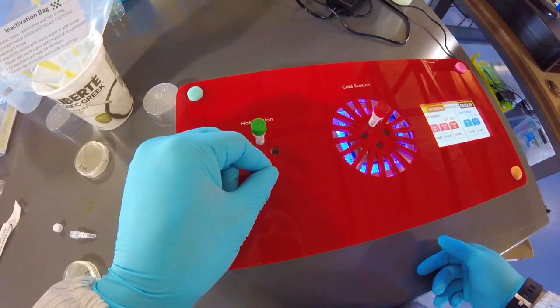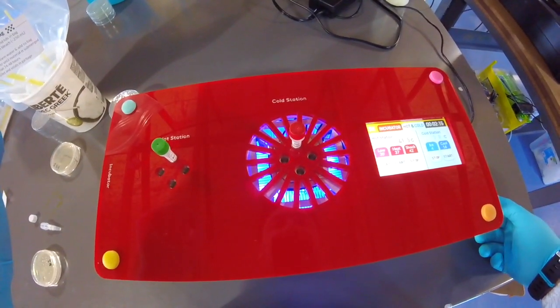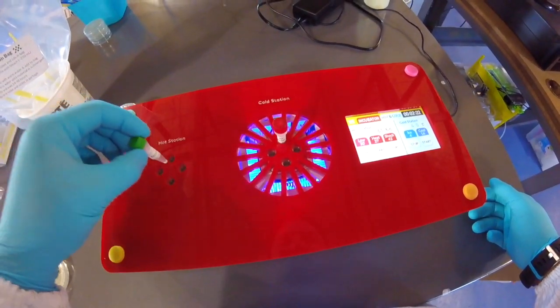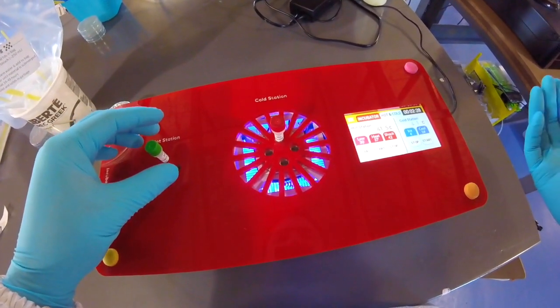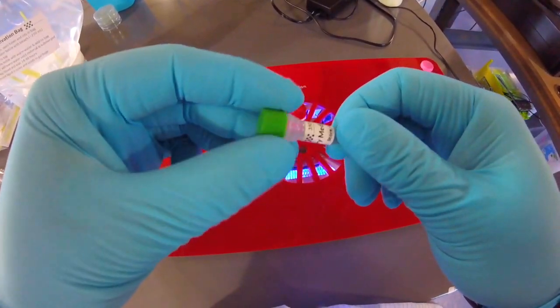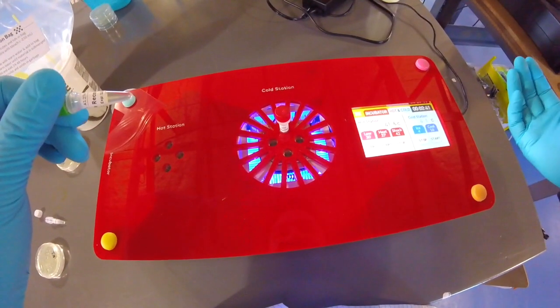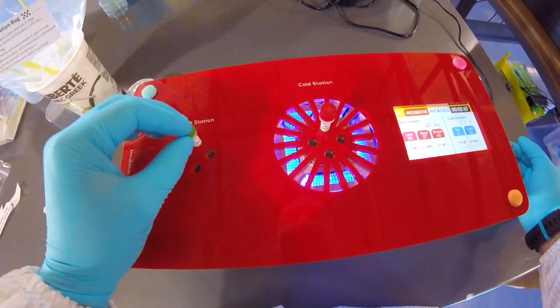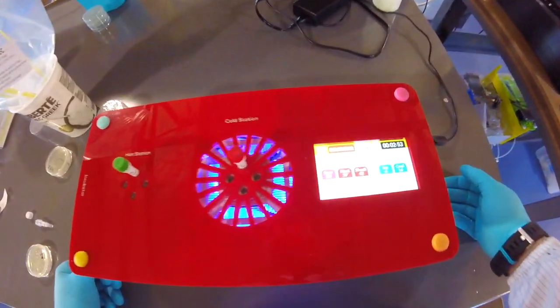And then after those 90 seconds, we're going to move it back to the cold station so that it cools down the membranes and traps some DNA inside. And then the last step is we're going to pour some of this recovery media into the cooled down cells. This is going to dilute the calcium so that it's not harmful to the cells, and it's also going to provide the nutrients, the amino acids, the sugars, the minerals that these poor bacteria need to grow and survive, all right? And then that'll be the last step. We're going to let this go for up to 24 hours, okay? And then day 3 will be taking these cells and putting them onto your Petri dish, okay?